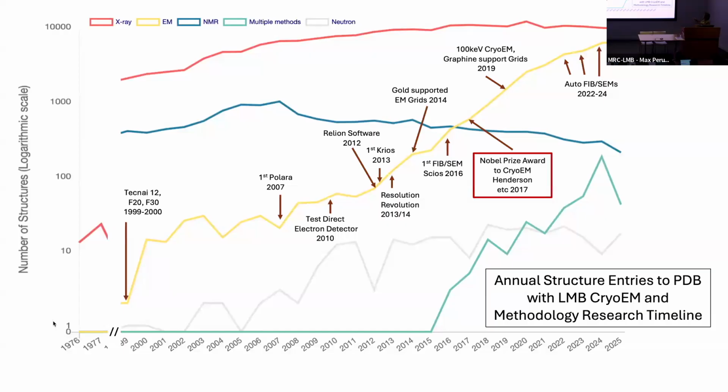So in here, I did not write down yet because we haven't bought the new microscope. There will be liquid helium, not just liquid nitrogen, liquid helium or phase plate, or even better electron lens, and aberration correction, like a CC corrector, a CS corrector. This kind of microscope will speed up this field.